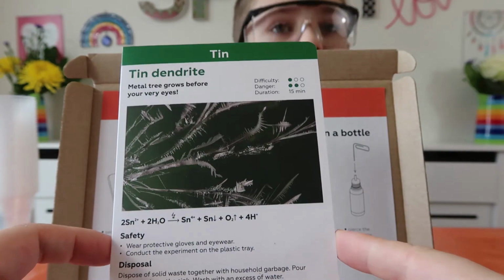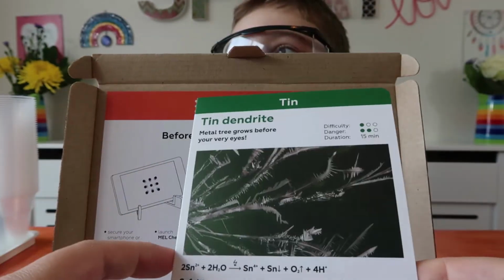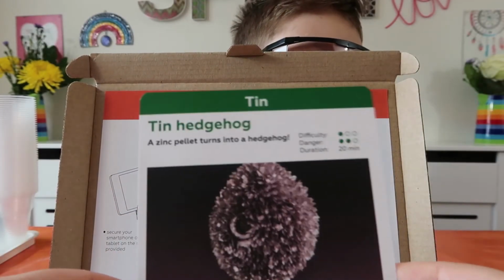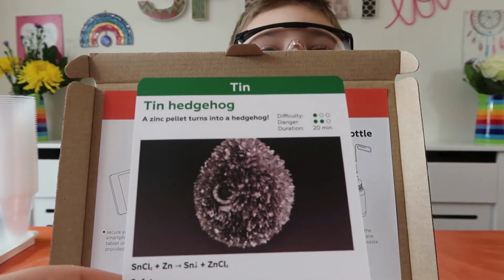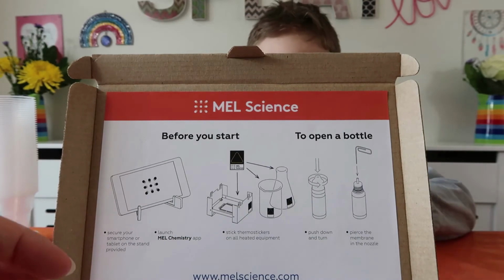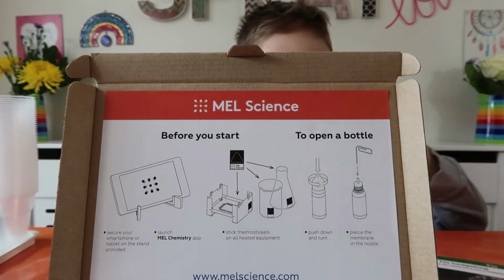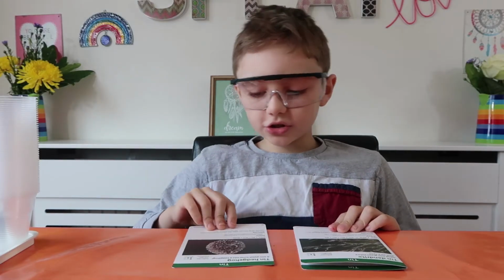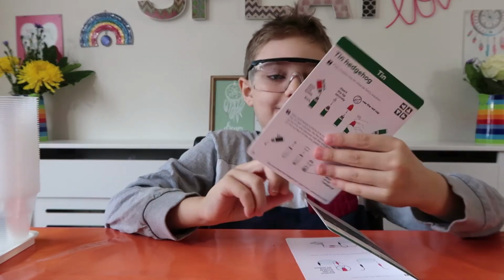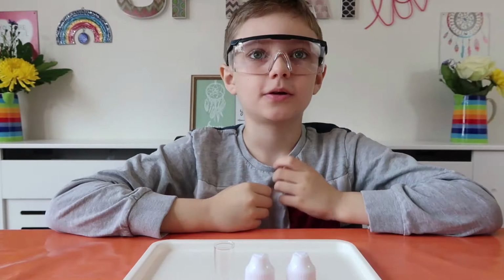Awesome. That looks really cool, doesn't it? So we can either do that one, tin dendrite, or we can do this other one, which is tin hedgehog. So a zinc pellet turns into a hedgehog. Okay. So which one do you like the look of the best? You have a look at those and see which one you want to do today. I think I want to do the tin hedgehog. Yeah, that looks awesome, doesn't it? I've seen the video online of this and it looks really cool.